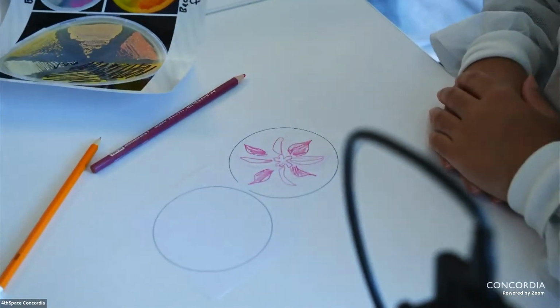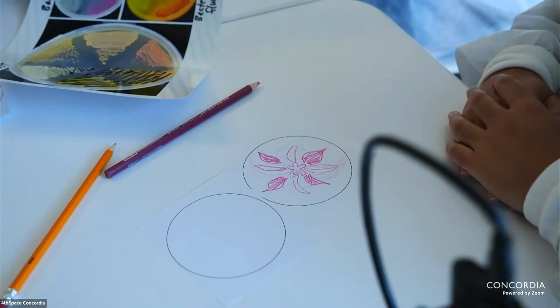Have any of you ever worked with microbes before? No? Okay, cool.